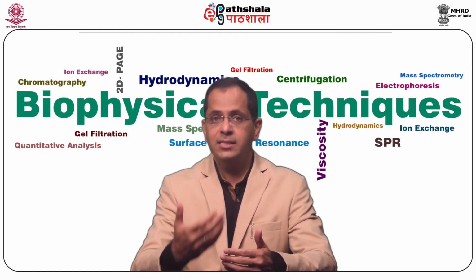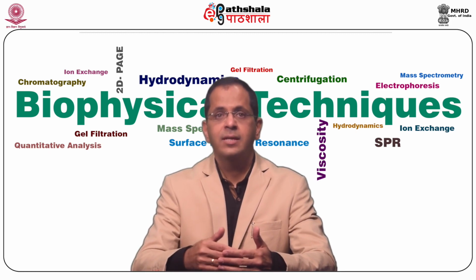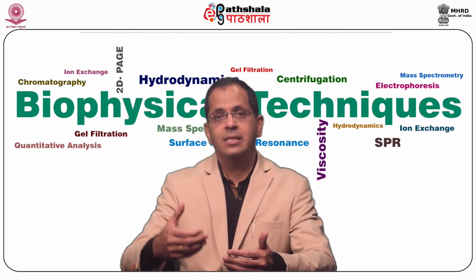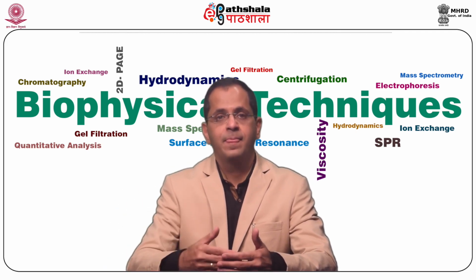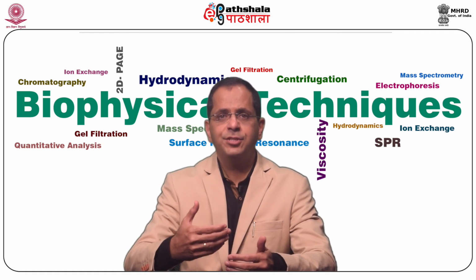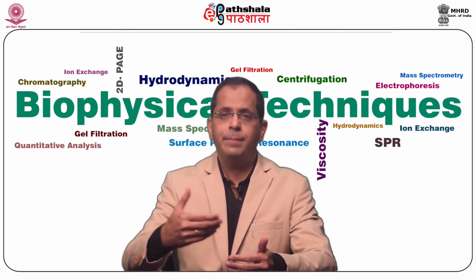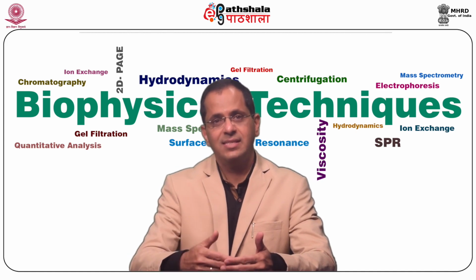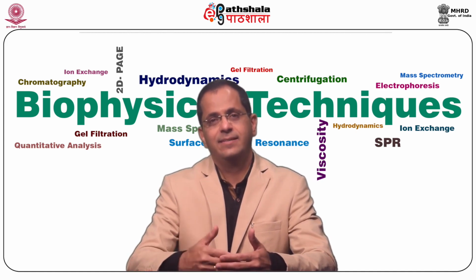Now, what are the disadvantages? The detection of protein isoforms can sometimes be a problem. There is the intrinsic limitation of mass spectrometry based peptide analysis, or what we have previously discussed as the ion suppression effect.